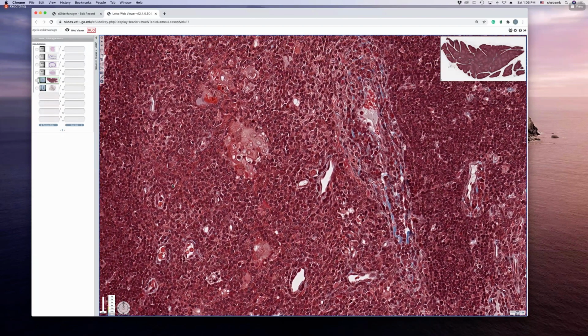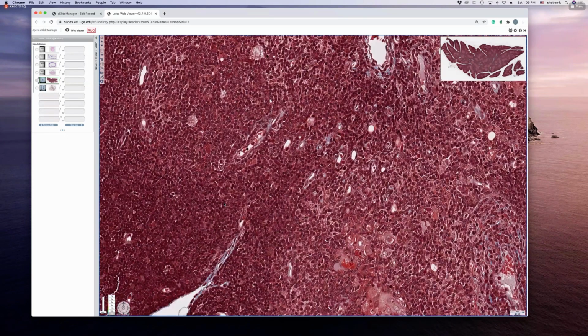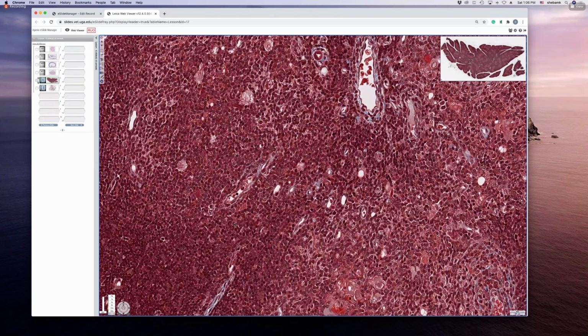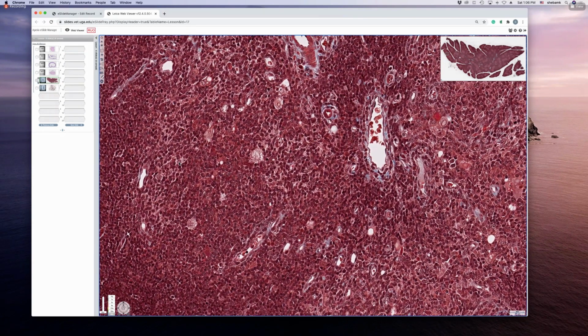Why can't I zoom in beyond this? I don't know why I can't, but let's keep looking because there are lots of them. These thymocytes are there only on a temporary basis. Look at this guy here, a euchromatic nucleus and lots of pale cytoplasm around it.